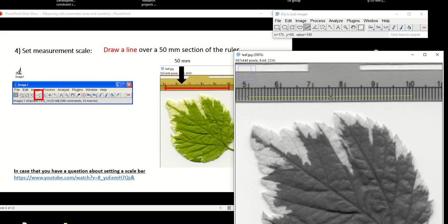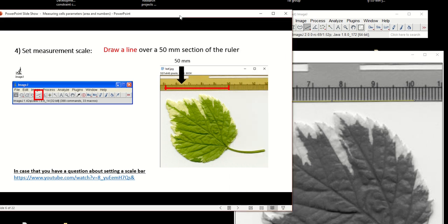And if you want to be even more careful, you can click and keep dragging it down, and see that it is parallel to the other line, or that it is on top of the other line. So it looks good. So now let's go to the other step.